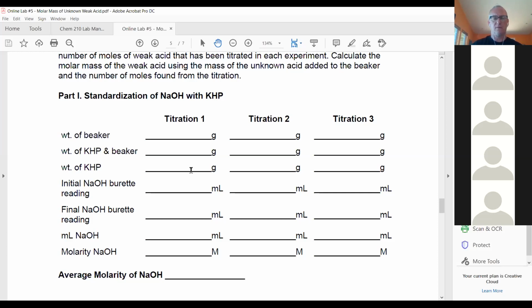Okay, thank you. So we will start our data from initial NaOH. We don't need to fill the 3 parts over. I'm sorry? In the table that you see now, so I don't need to fill the first and second and third one. I will just start. The third one you need, yes, you need the mass of KHP. Okay, just the mass. So the mass of KHP, you use the weigh boat, right? No, I mean, just put in a gram or whatever it is, 1.2 grams. Just basically give me the number of grams and how many significant figures you measured it to. That's another thing. You could measure it to 4 significant figures if you want. I think that's possible with the scale.